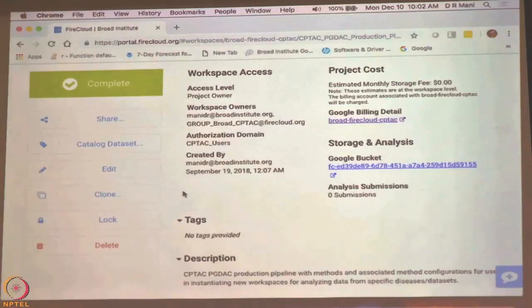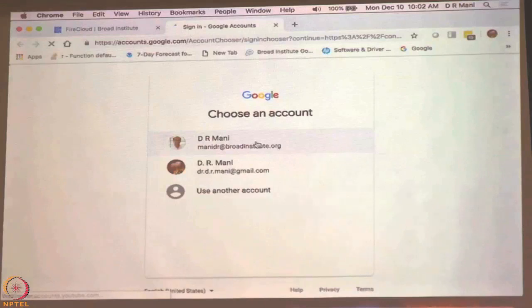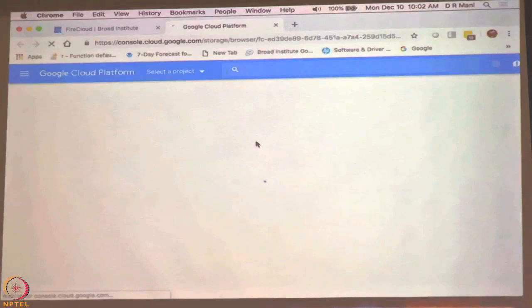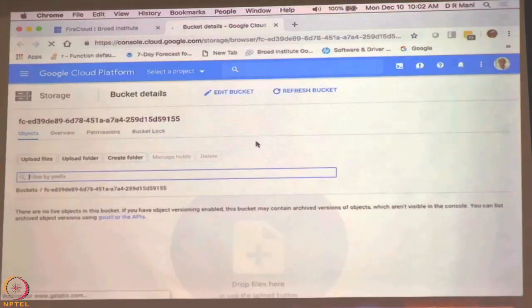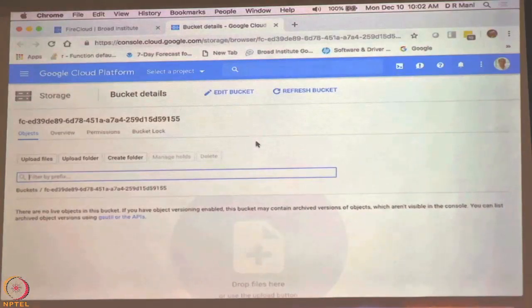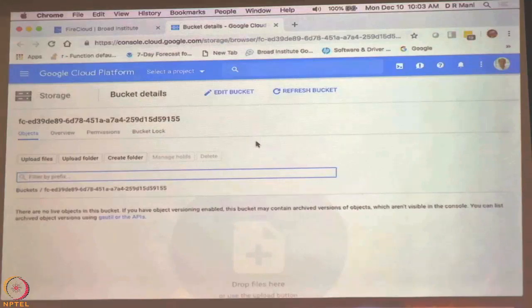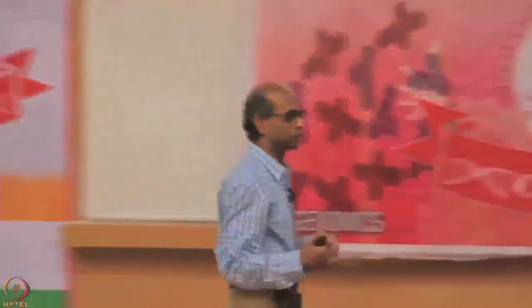Accessing a bucket is again based on permissions — you have to have the permissions to access the bucket. This bucket is showing there are no objects in it because this is a workspace we set up to just store methods. When we need to do a real analysis, we copy the methods from here into a new workspace, put the data in the new workspace, and do the analysis. Every time you get different data — breast cancer data, ovarian cancer data, or new versions — the settings used to run the methods also change. So we keep the methods in this workspace and then copy them to a new workspace to apply them.